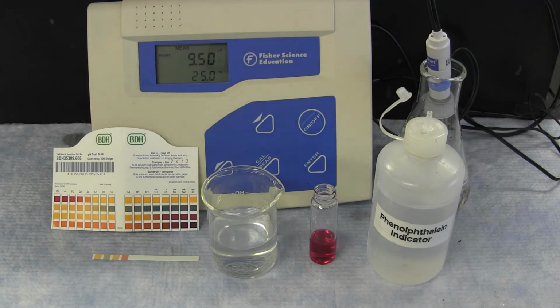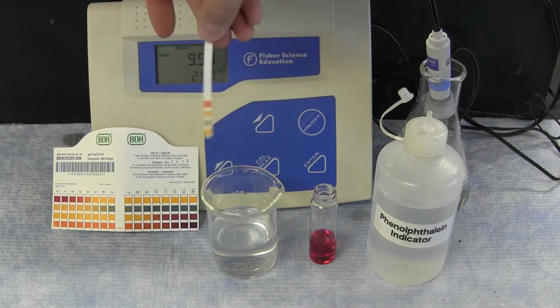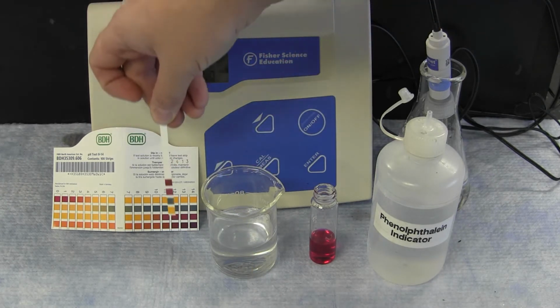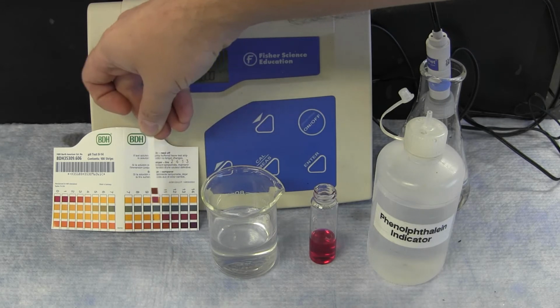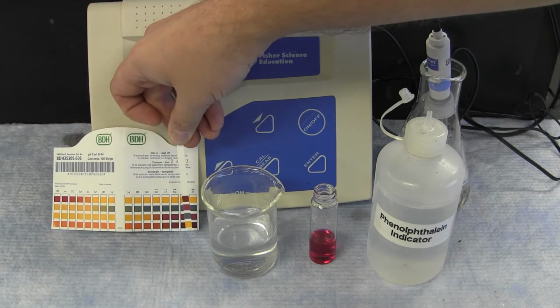pH paper is a set of different pH indicators that are absorbed on paper. Similar to how you would check the pH in your home pool, a pH indicator strip is placed in the solution and then compared to the color chart to determine the pH value.